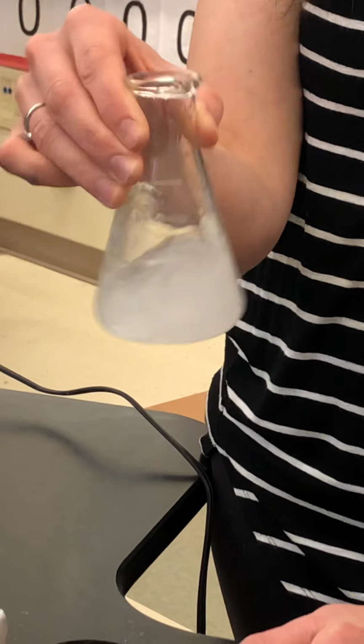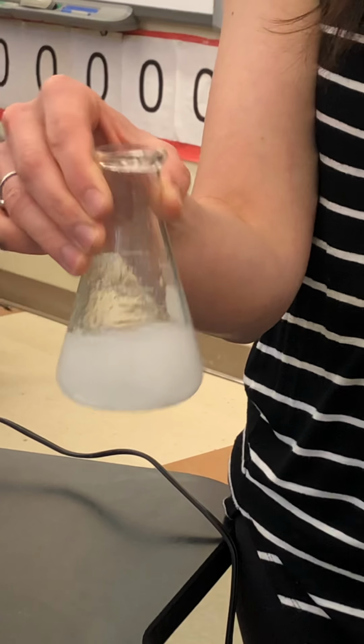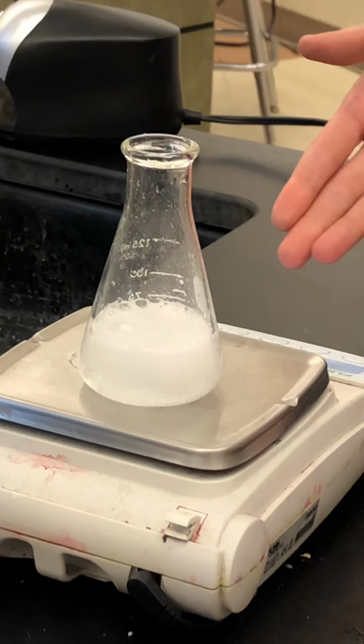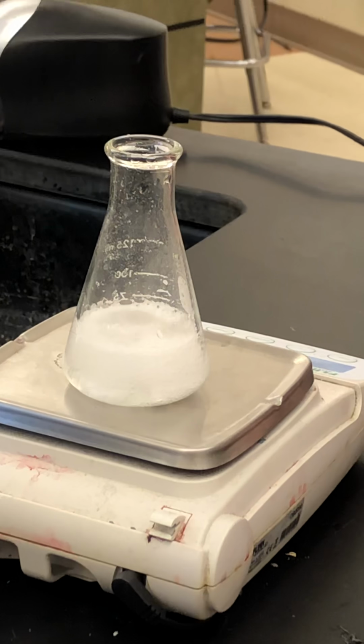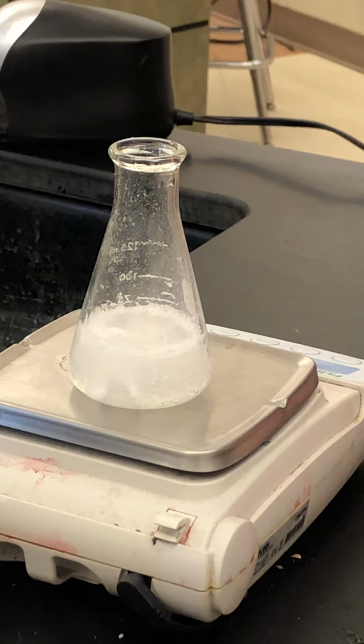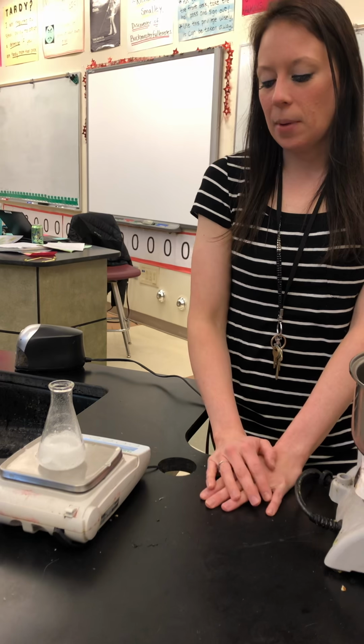Okay, so then what we did was we broke the tab and allowed it to dissolve, and we saw that bubbles are forming, and that's because the carbon dioxide is escaping, one of the products that's forming. And so we actually see that the mass goes down. So after a few minutes, we took the mass again, and again in the absent student data, it said that the mass went down to 99.5 grams, which means that 0.5 grams of carbon dioxide was produced according to our lab results.